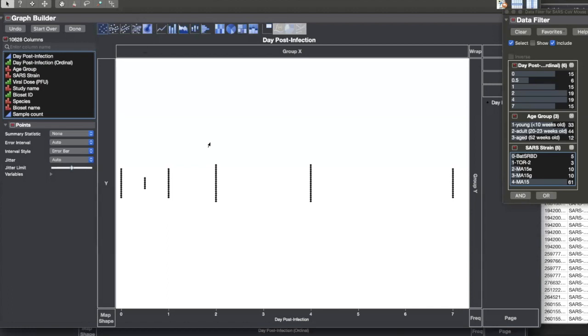Now what we can do is, obviously we've got all this data together. What we can do is look at genes now, right? Anybody have a particular gene they would want to look at according to this data set? Any ideas? What would you want to look at? The one that's changed the most. And we are going to find that. But here's what we can do. Let's look at the ACE2 that the virus uses to bind to get into the cell. Let's take a look at that one.